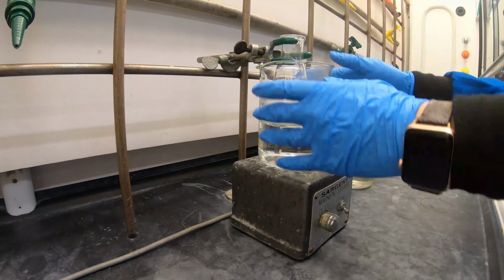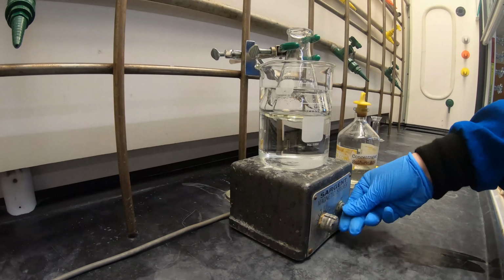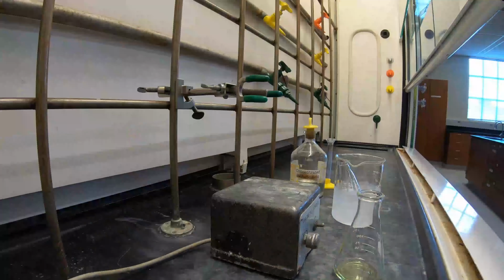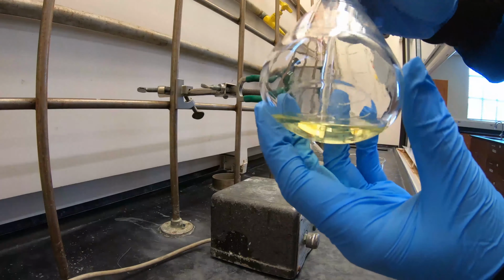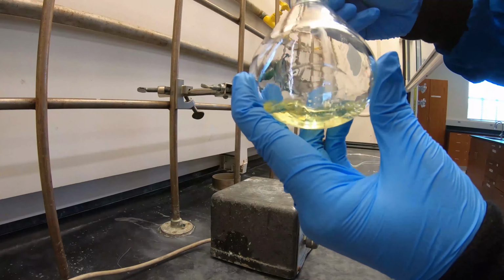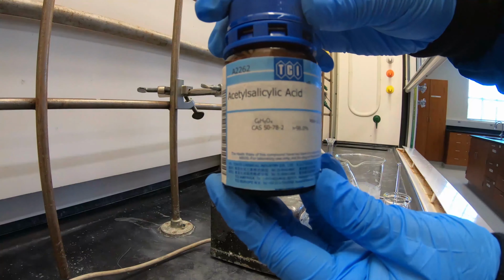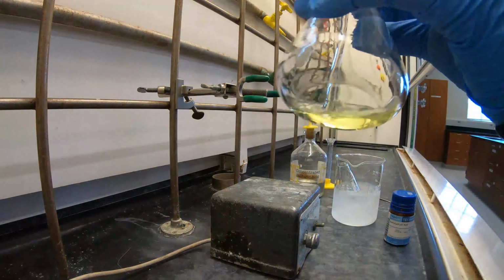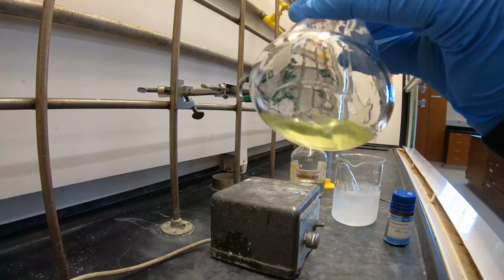Leave it to stir and dissolve for about 5 minutes. Once our acid is dissolved, remove it from the hot bath and place on your bench top to cool. Once at room temperature, use your glass stir rod to scratch to induce crystallization. If crystals do not begin to form, then add a small amount of pure aspirin to seed crystallization in your compound and then scratch again with your glass stir rod.